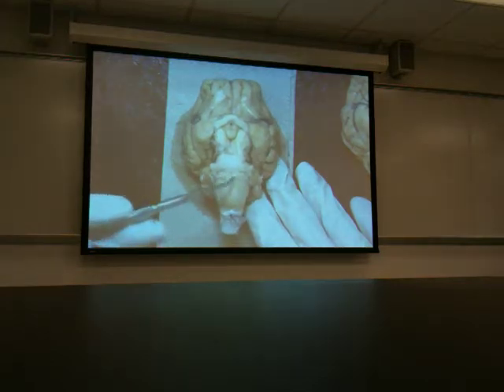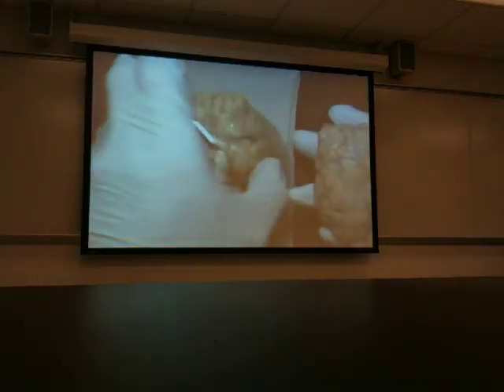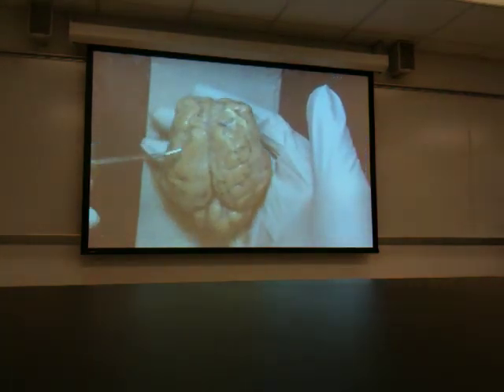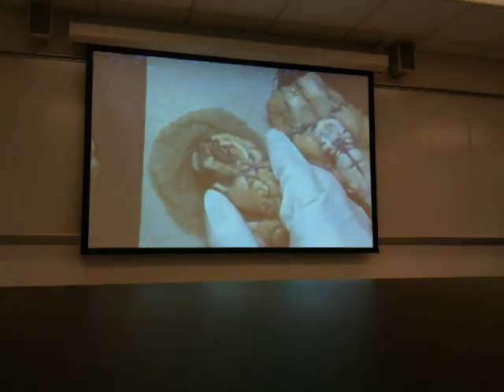Now, the reason this is so darn good here, obvious, is because that cellophane-looking stuff, which is the arachnoid, look at it on this brain. You can kind of see that it looks glistening, does it look spider webby? In some places it does. Right here it looks spider webby. Do you see that right there, that black? That's the arachnoid. That's the spider web of the arachnoid.